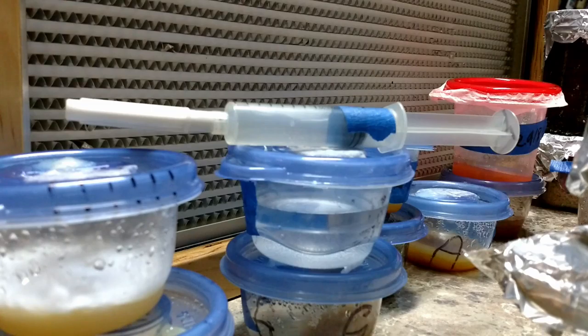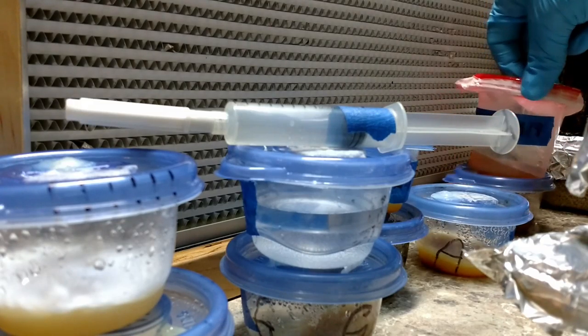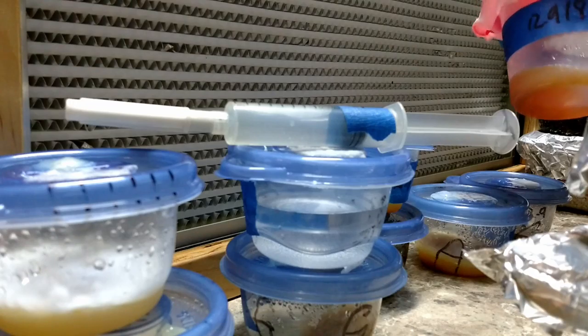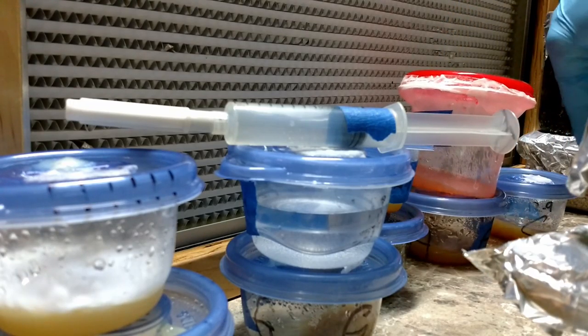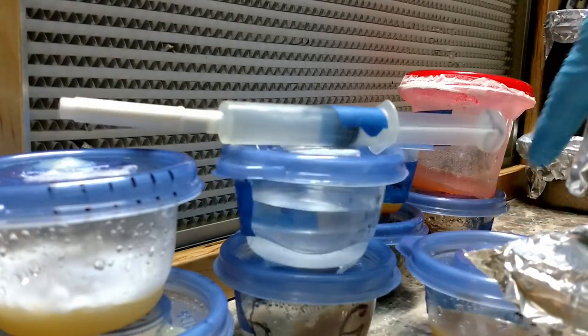Now that we have that, we're going to start injecting everything else. We want to do a BRF cake with the spores, so what I'm going to do is hit agar plate A and a couple of others — let's say plate C.